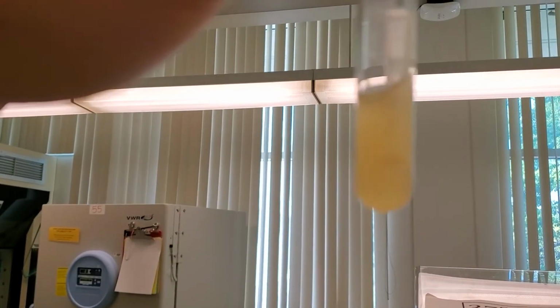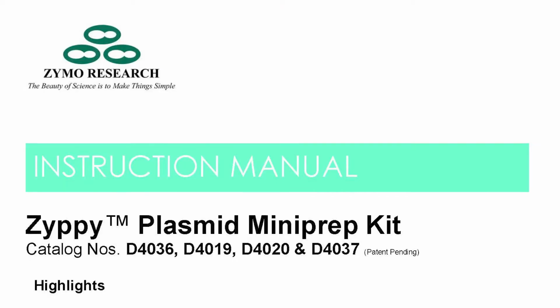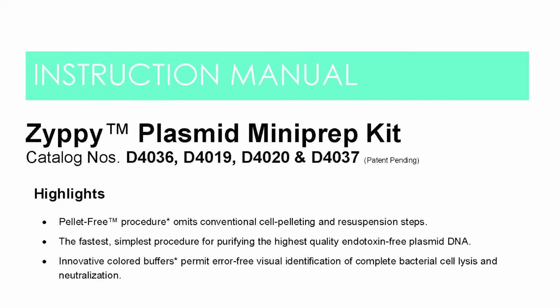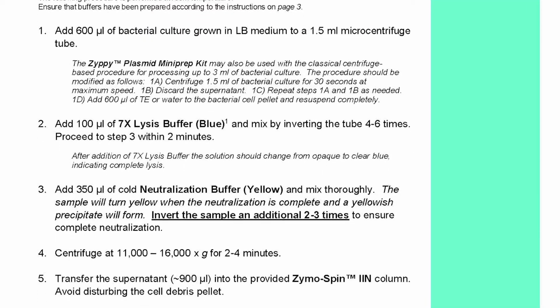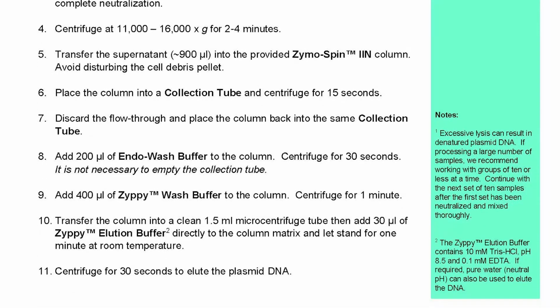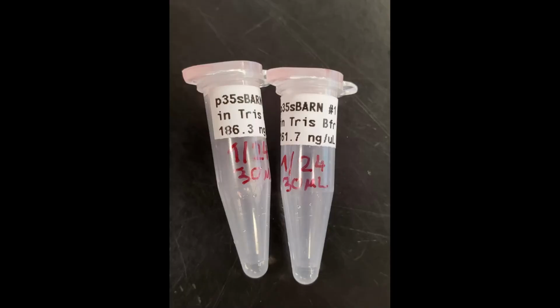When you have your dense overnight culture, you will need to extract the actual plasmid DNA from it before you can proceed to the next steps. This is usually done using various proprietary extraction kits. The exact procedure will depend on which particular brand and type of kit you're using. Your output will be a large amount of DNA suspended in a small volume of buffer.